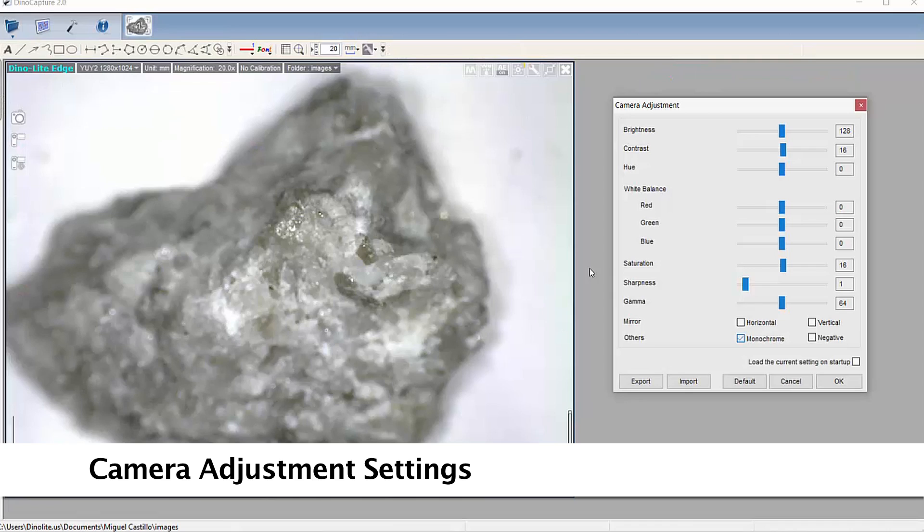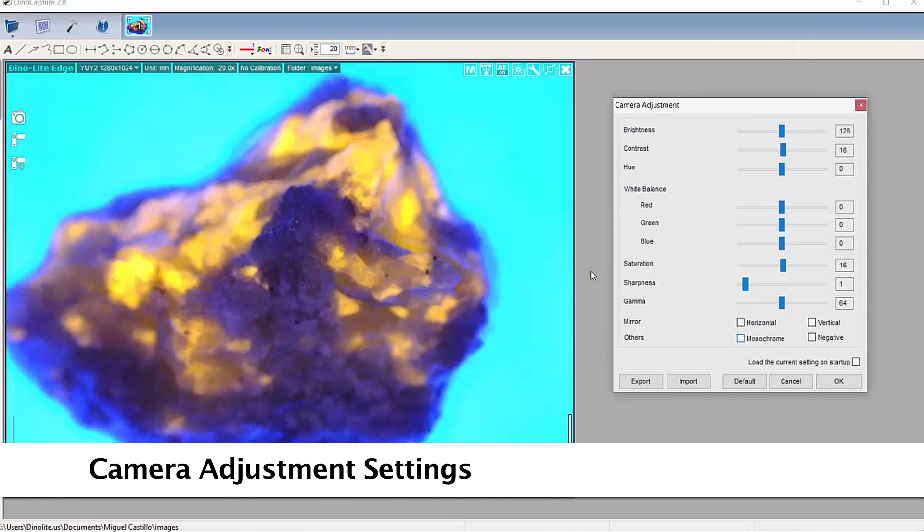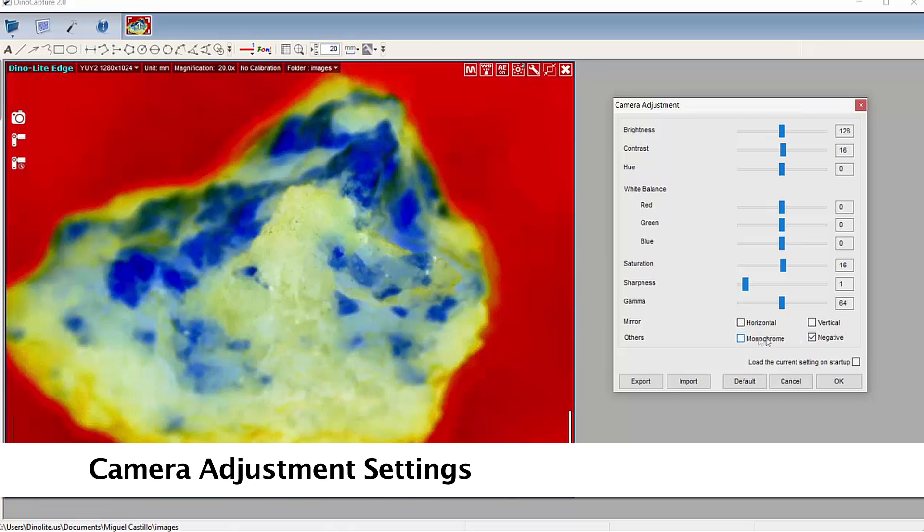Some adjustable camera options include white balance, brightness, contrast, hue, as well as negative and monochrome modes and more.